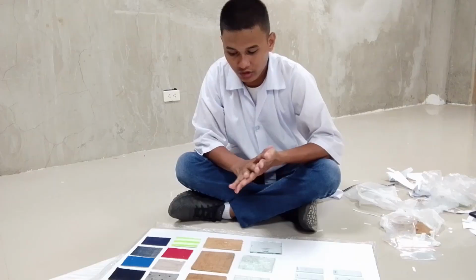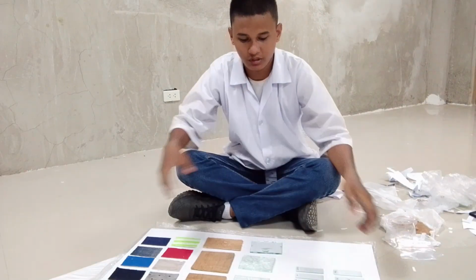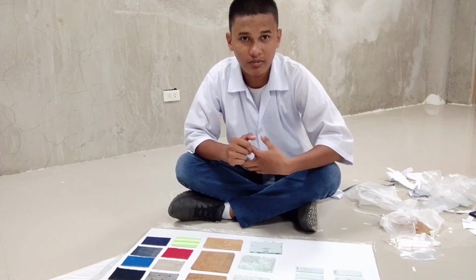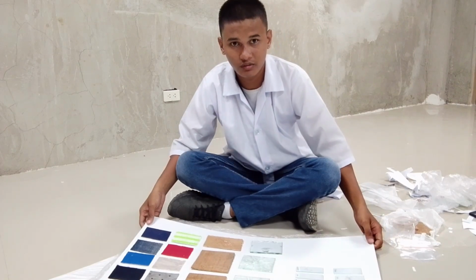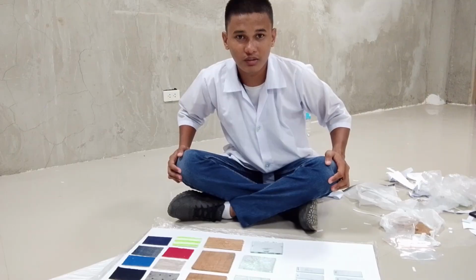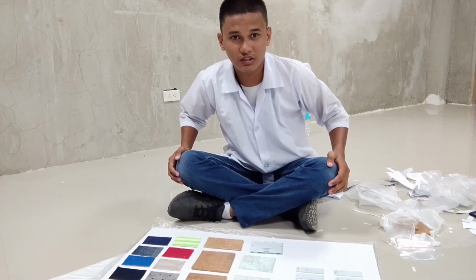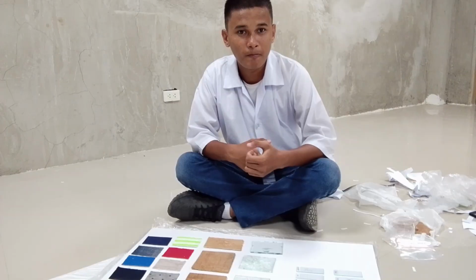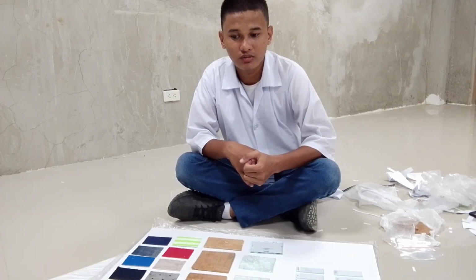We have done the samples of the 5 stations. After this, I will cover the clear or transparent plastic cover to be submitted. I have done activity number 5, identifying the different types of hair, fiber, paint, tool marks, and glass.